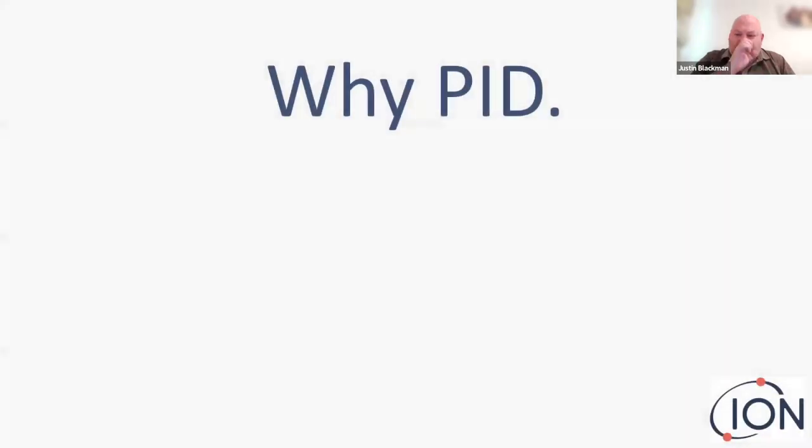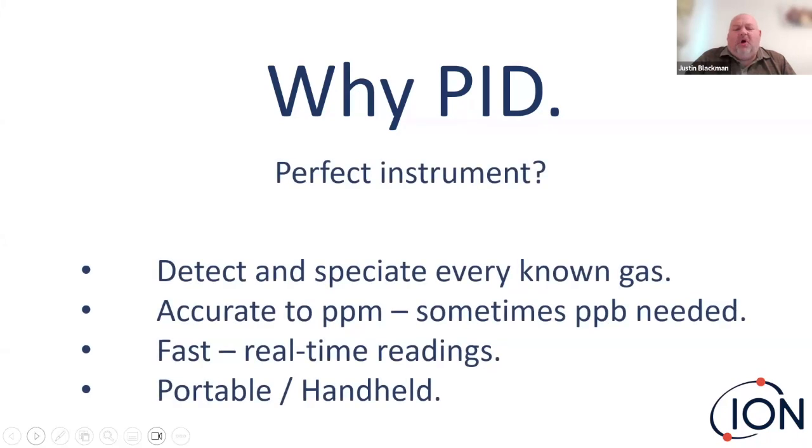So I'm going to jump slightly sideways and ask the question, why PID and not some other technology that is already out there? So first off, I'm going to ask, what would a perfect instrument be?